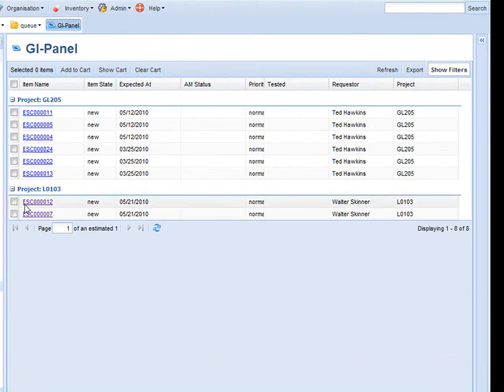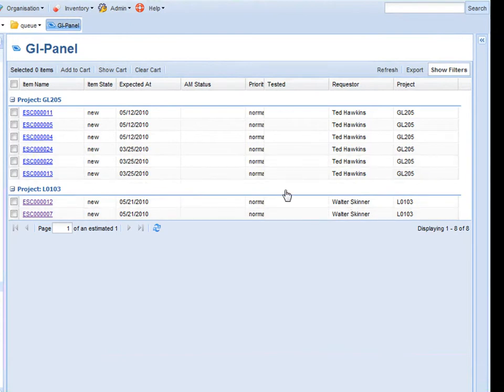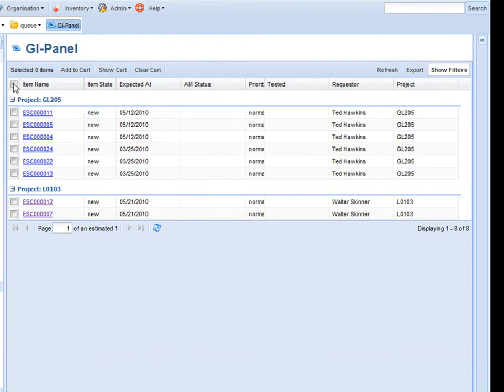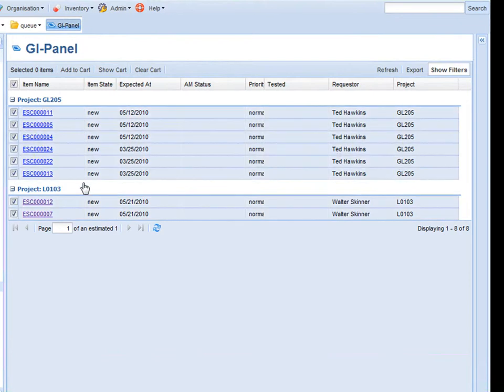So in this case I can see there are two requests for the L103 and also a number of requests for the GL205 project. Let's move all those into a work package.